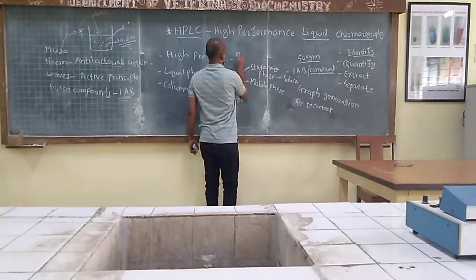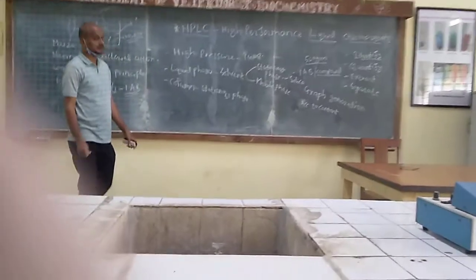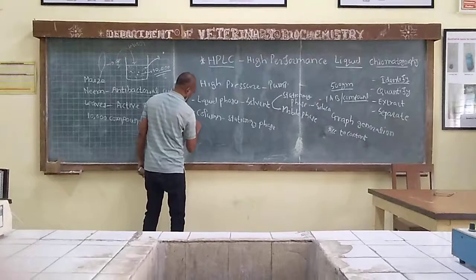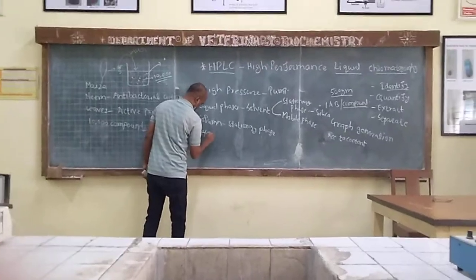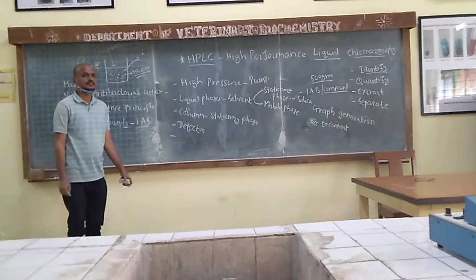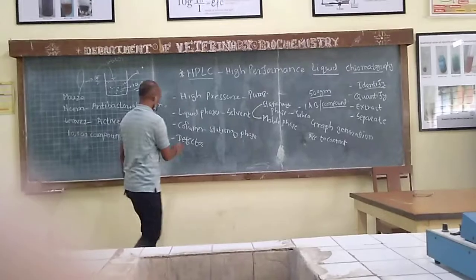Pump. Next, detector. Next, software attached to it.